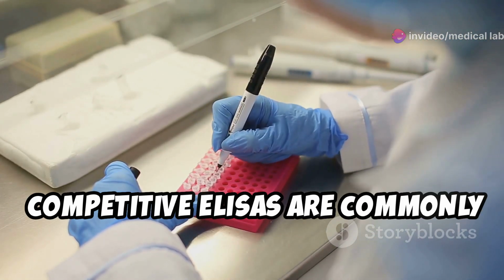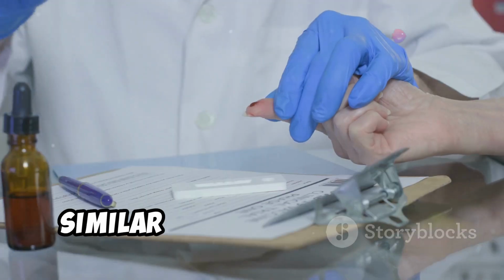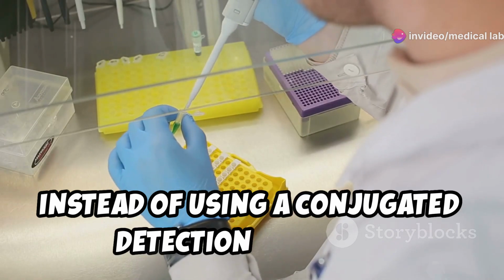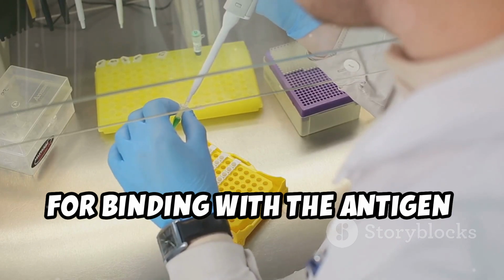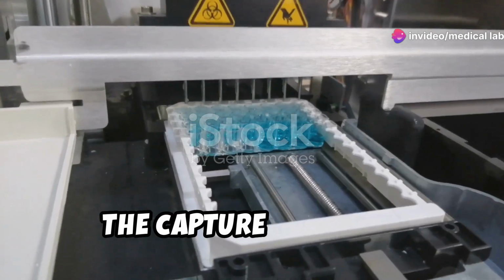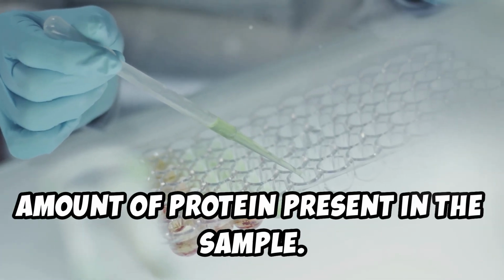Competitive ELISAs are commonly used for small molecules, when the protein of interest is too small to efficiently sandwich with two antibodies. Similar to a sandwich ELISA, a capture antibody is coated on a microplate. Instead of using a conjugated detection antibody, a conjugated antigen is used to compete for binding with the antigen present in the sample. The more antigen present in the sample, the less conjugated antigen will bind to the capture antibody. Substrate is added and the signal produced is inversely proportional to the amount of protein present in the sample.